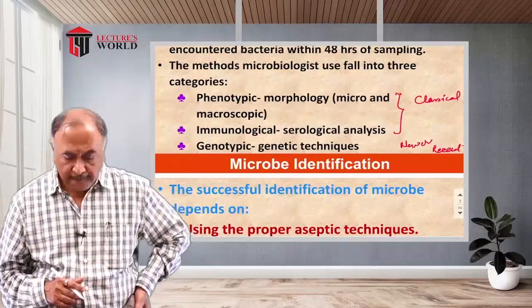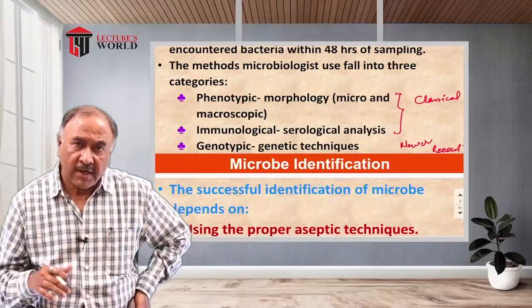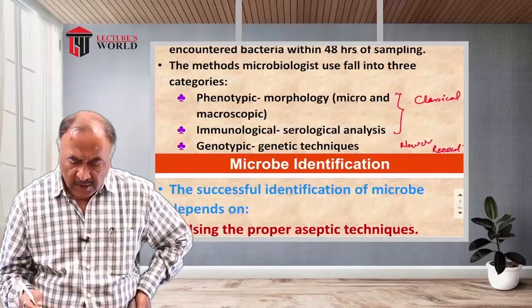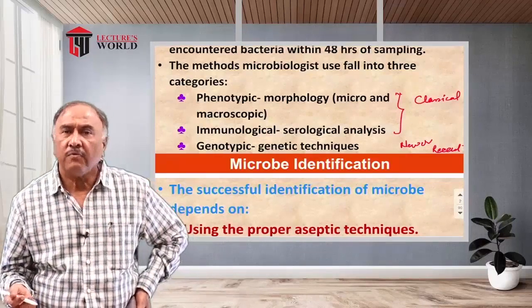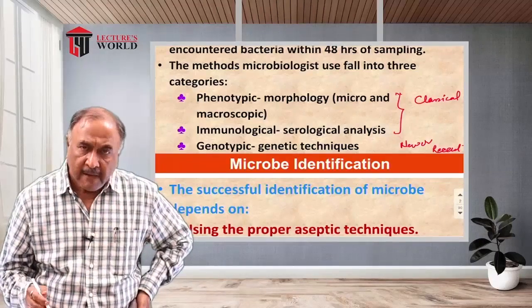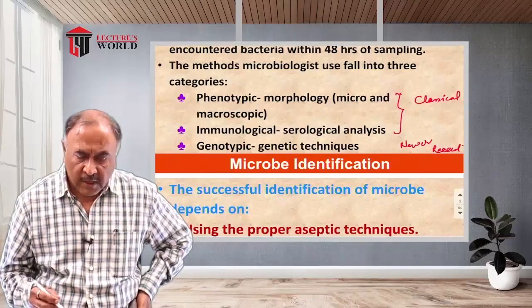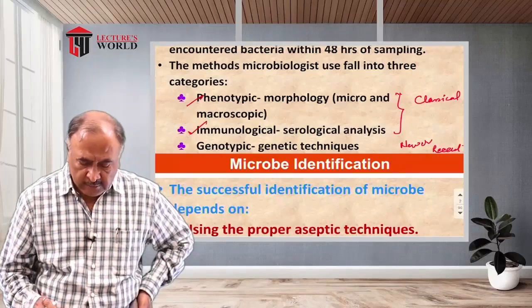There are advantages and disadvantages of both these types of techniques, but the genetic techniques are newer, recent, costlier, and very few laboratories have them. And therefore, most of the identification of the bacterial pathogen is done on the basis of these two classical methods.